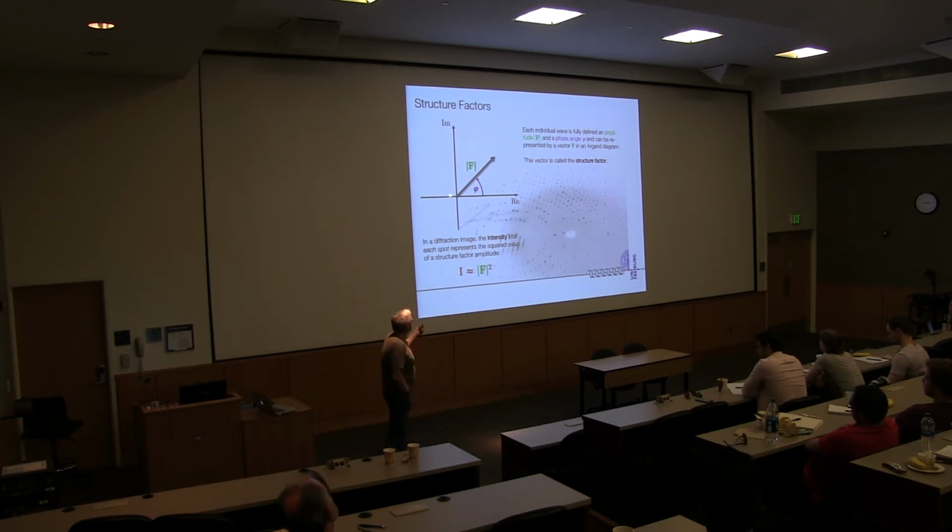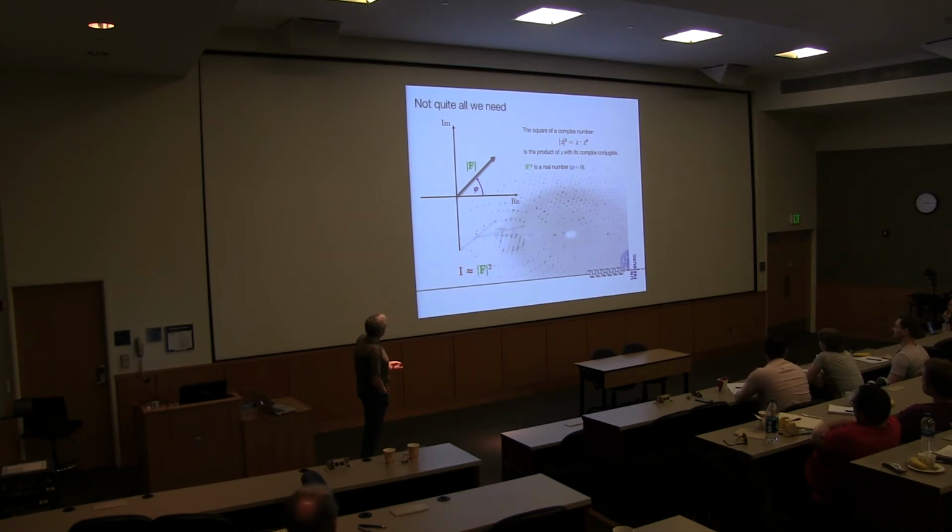And this is called the structure factor. That is our representation in Fourier space. That is the wave function we need to add up. And this wave function can be measured from the intensity of our black spots. So we're almost there. That's just this here, the intensity of the black spots. Okay. The problem is, this is a complex number. And what we are measuring, the intensity, is the square of the amplitude, or it's actually the square of the structure factor if you want.